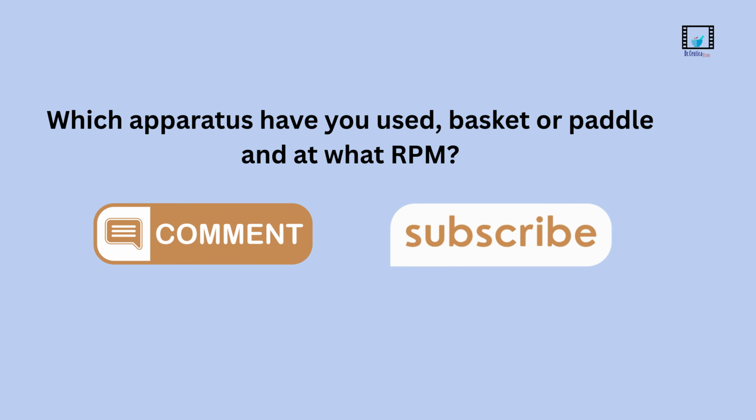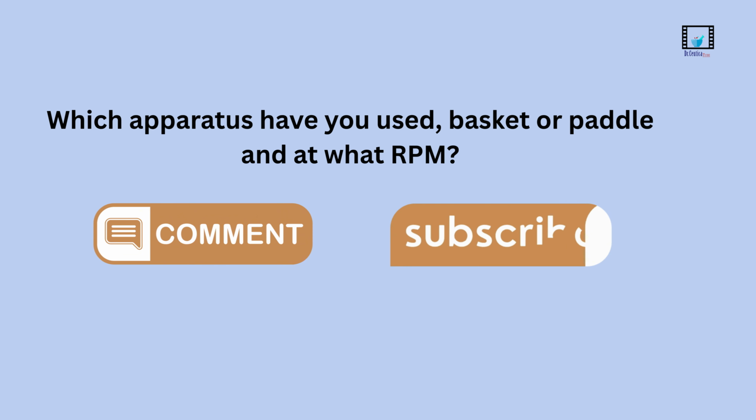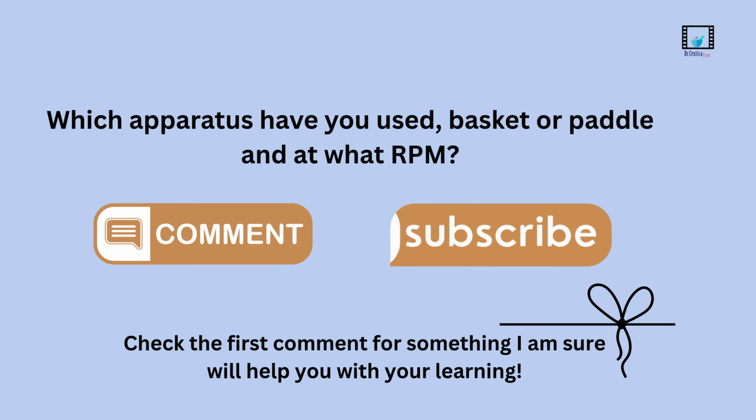One final question for you. Which apparatus have you used, basket or paddle, and at what RPM?